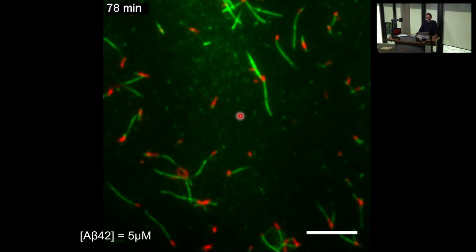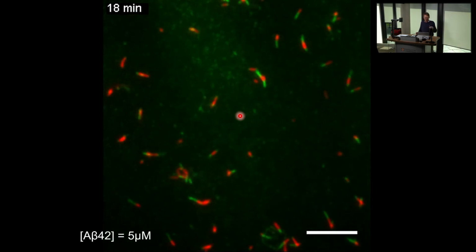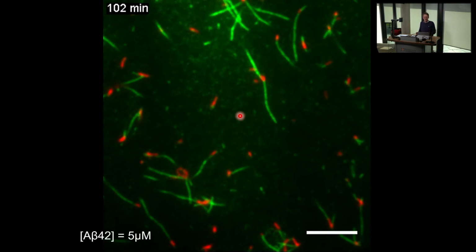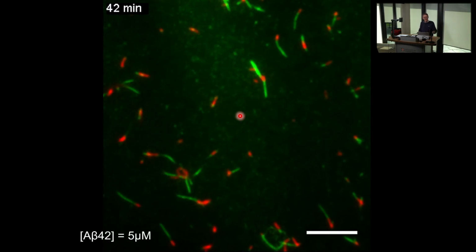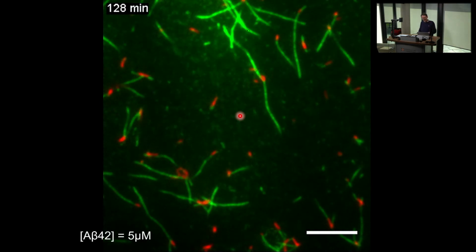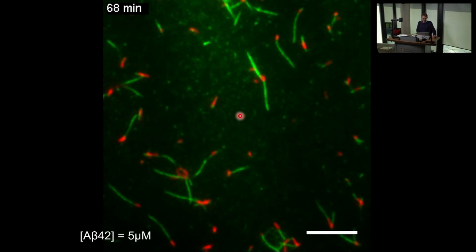You can use this assay to test small molecule inhibitors or small molecule drugs. By putting them on there, can you prevent that aggregation reaction from taking place? I want to bring home again, it's now possible with these high-resolution imaging methods to look at the kinetics of such biochemical reactions on a single molecule basis, molecule by molecule.